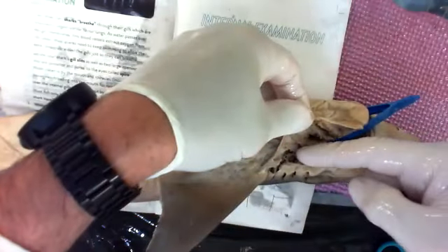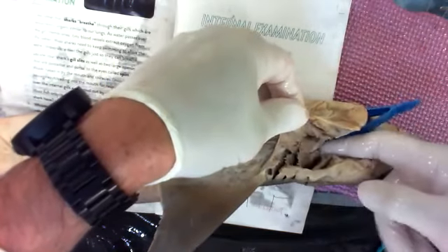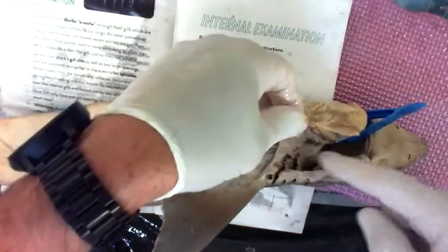That's what I want. I went right there to the shoulder. Boom. When I started cutting, I cut kind of light, closer, superficial to the surface because down here is the mouth and its passageway and I don't need that. I just want to see these gills.